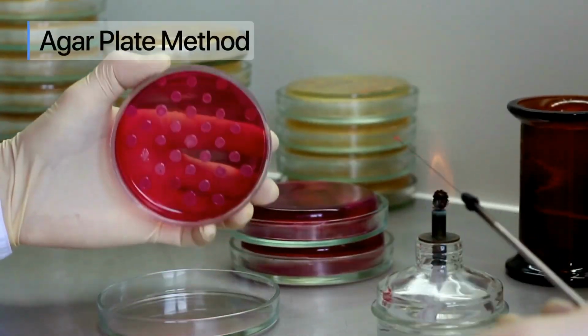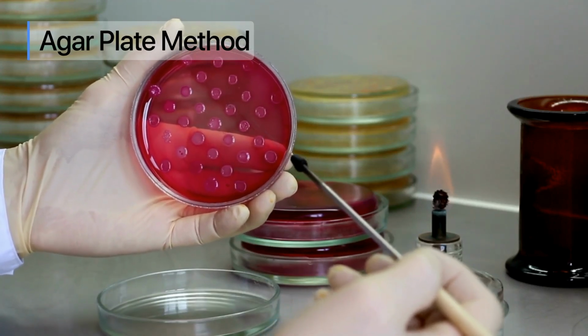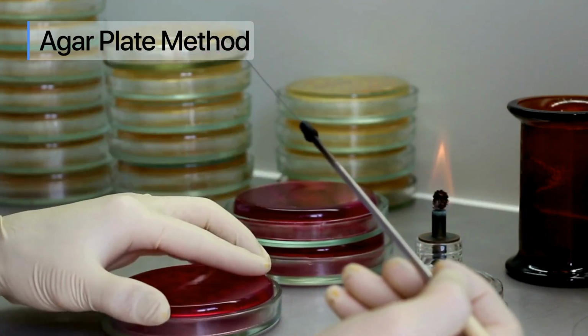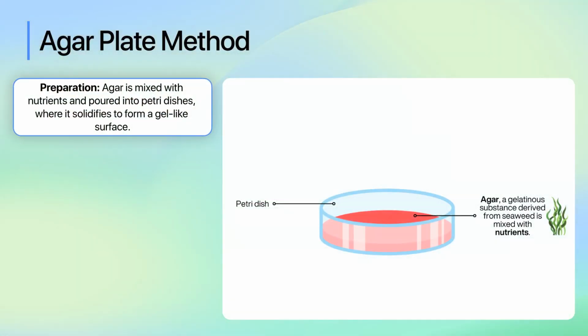The second method, used to cultivate microorganisms, involves using agar plates, a Petri dish containing a growth medium. Let's break down this process. To prepare the medium, agar, a gelatinous substance derived from seaweed, is mixed with nutrients and poured into Petri dishes, where it solidifies to form a gel-like surface.